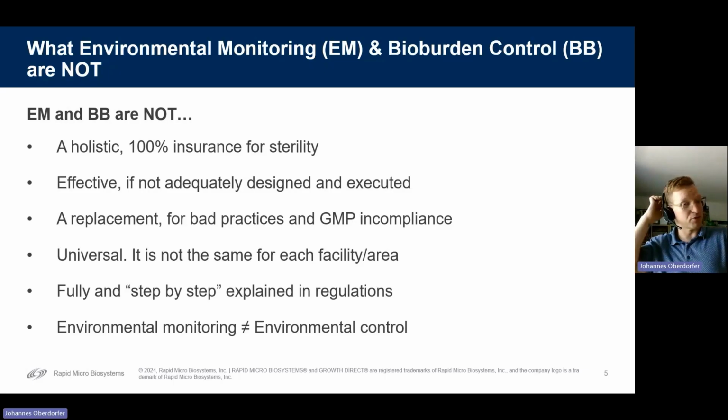The other important point is that environmental monitoring is definitely not environmental control. I think microbiologists know this, but it is something that has come up quite often, that these terms are exchanged and mixed up quite frequently.